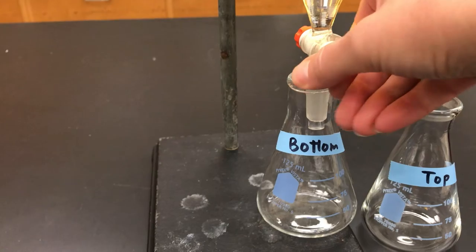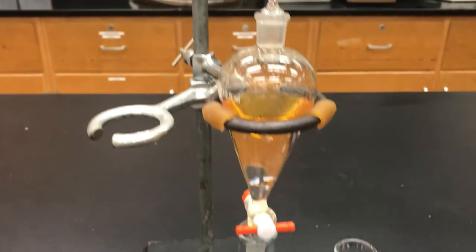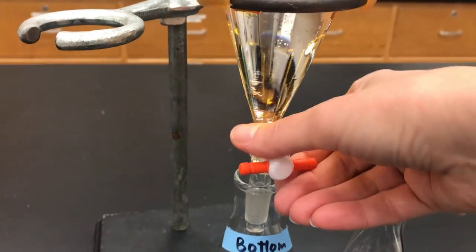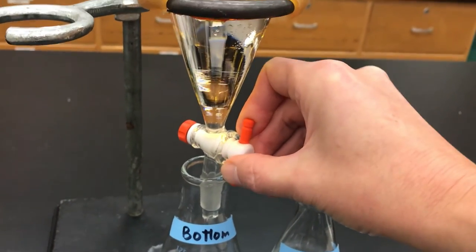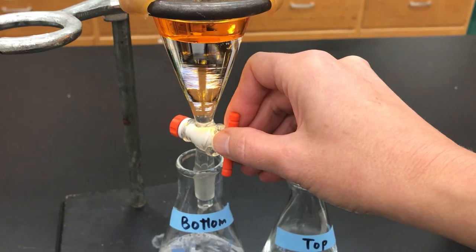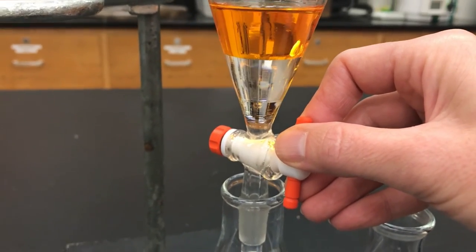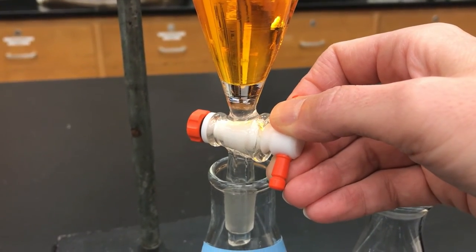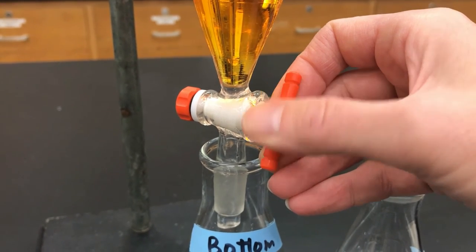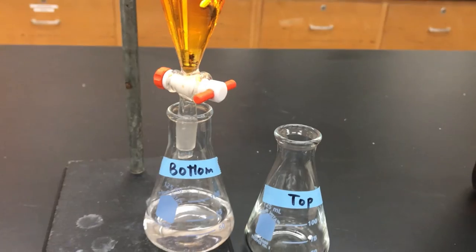Open up the stopcock and start draining into the bottom Erlenmeyer flask. If you find it doesn't drain well, it's because if you don't open the stopper, the liquid that drains out can't have air replace it, creating negative pressure. So take the stopper off, then open the stopcock and drain into the bottom flask. You're going to go right until the interface between the orange and the clear layer reaches the stopcock — when it gets close, slow down and stop carefully.